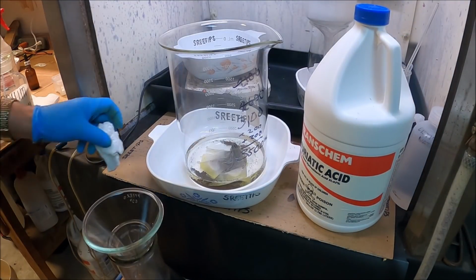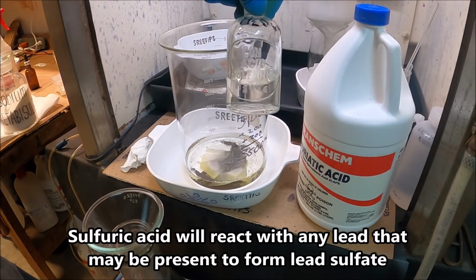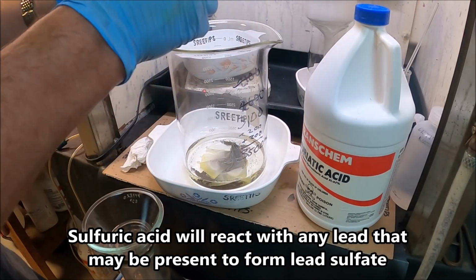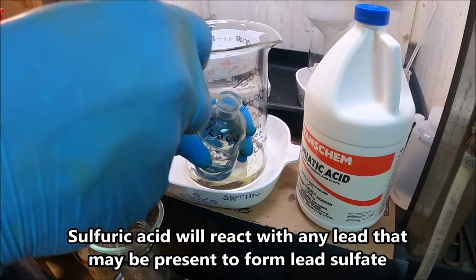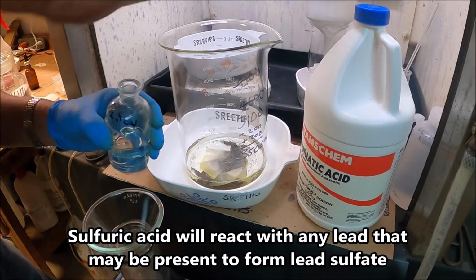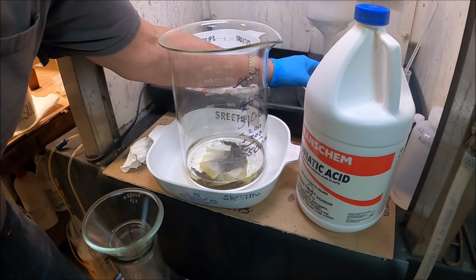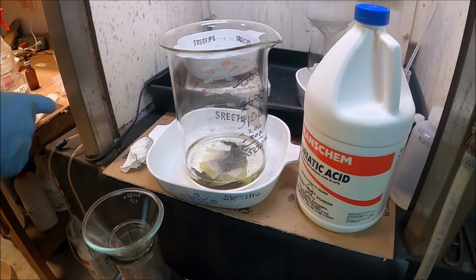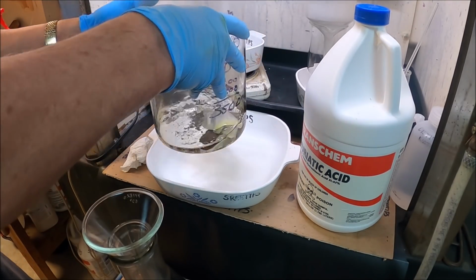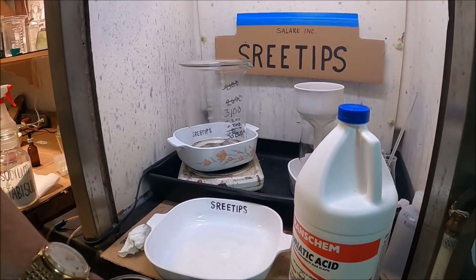And before we go any further, I've got some sulfuric acid here. What I'll do is add a few drops of sulfuric acid just to make sure we don't have any lead in here. And then I'm going to put this up on the heat. Start adding small doses of nitric acid. Get everything to go back into solution.